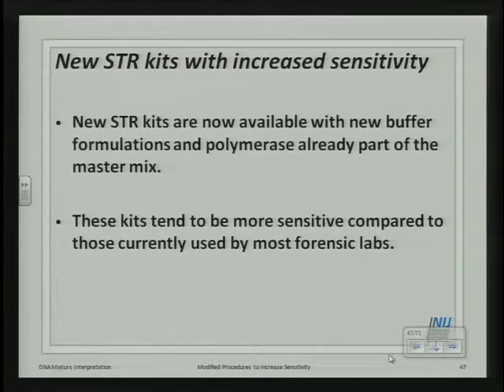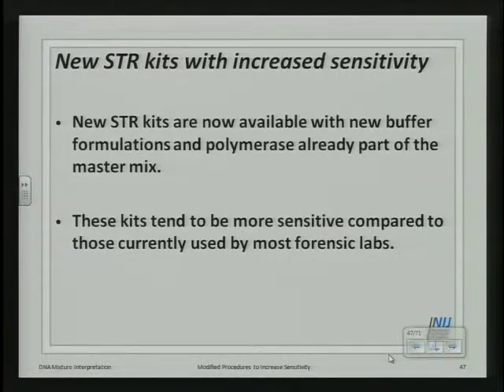One thing we have to be concerned with, or at least aware of, is that these new STR kits have modified buffer formulations and polymerases that are already part of the master mix. So it may not be, well, I'm not adding extra Taq, but again, with it being proprietary, we don't really know what the formulation is. There may be extra Taq in the buffer.